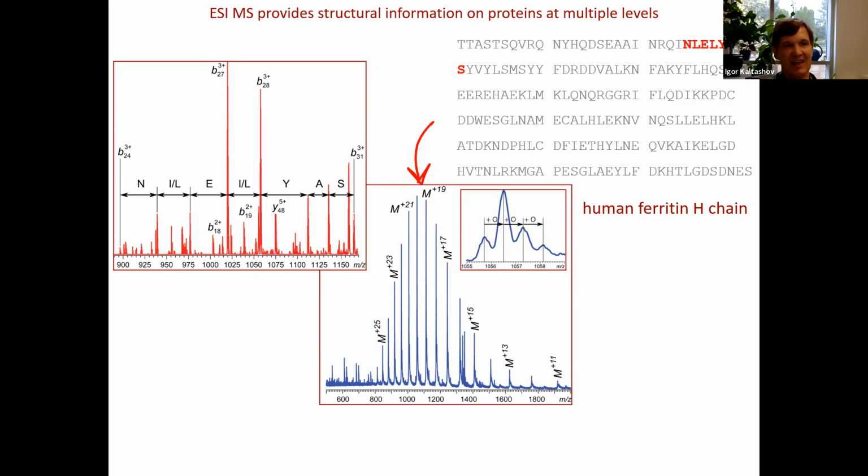I'm not saying this is native solvent, because remember, in electrospray ionization, unfortunately, we cannot use non-volatile buffers or non-volatile salts, but we can still make a wise selection of components for our solution, and we can maintain physiological pH, physiological ionic strength, and so forth.